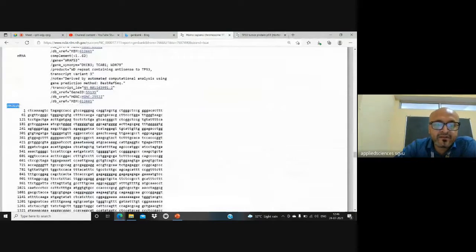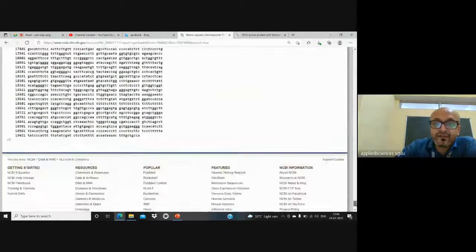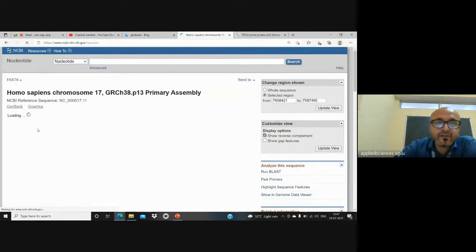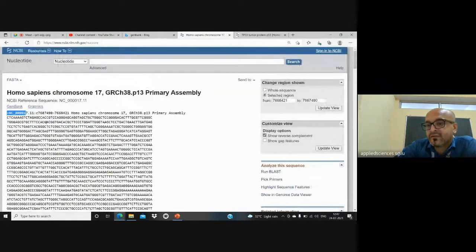This is the origin, and this is giving you the complete sequence of 19,000 bases in the form of ATGC, and this is called the flat file format. Fine. So this is 10, 11 to 20, 21 to 30, and so on. When I say you have to retrieve the sequence, this is the sequence you have to retrieve, but always retrieve it in FASTA format. You click on FASTA, and here you go. Starting from the greater than sign and the accession number, you will get the complete FASTA format sequence. You can take this sequence and go ahead.